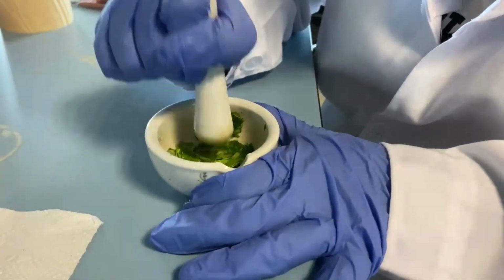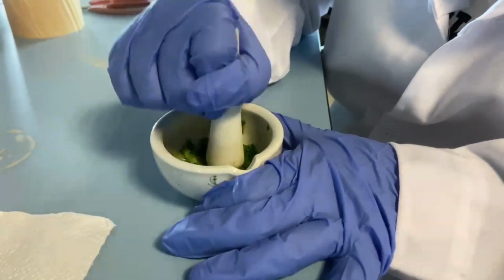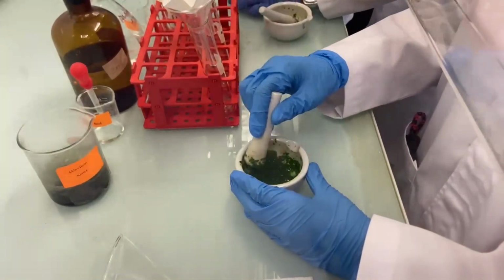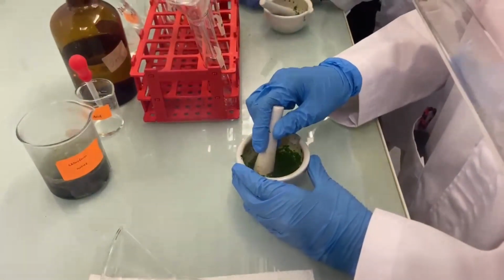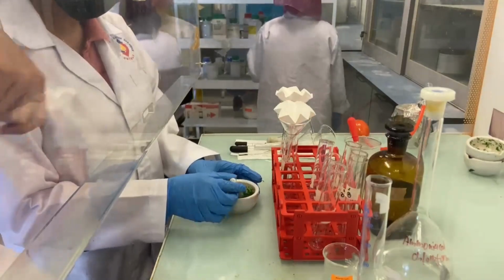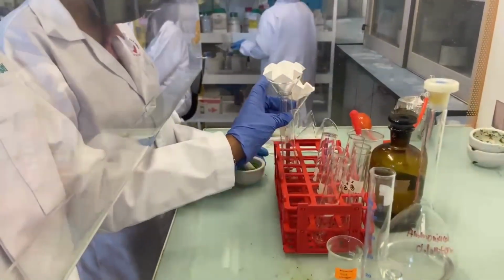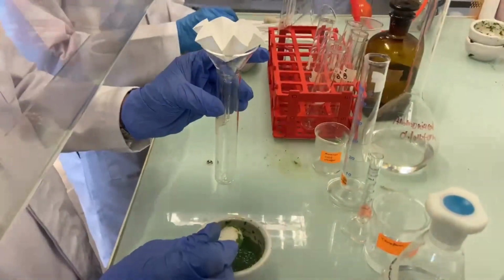samples. For the methodology part, we started off with grinding 5 grams of the fresh sample. 10 milliliters of chloroform was added while the sample was ground. Next, 10 milliliters of ammoniacal chloroform was added and mixed thoroughly. The sample was filtered using Whatman number 1. When the chloroform layer was separated, the remaining extract was transferred into a test tube.